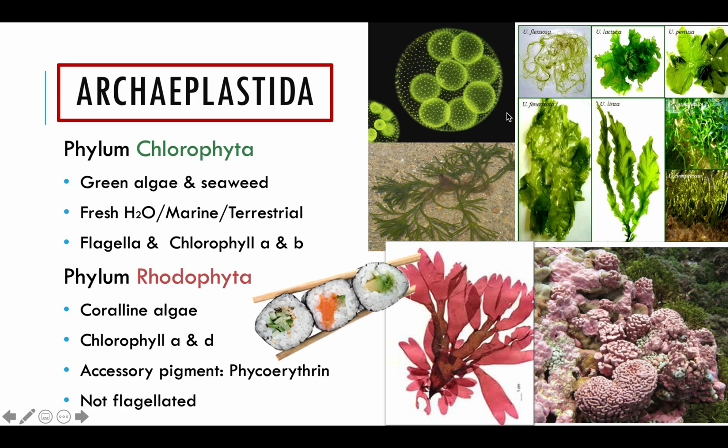So we have organisms like Volvox and algae in this group. If you're looking at a Volvox, this is the entire cell, but inside you have what are called daughter colonies. So these circles, your lab manual is going to ask you to label them. So make sure you label the inner circles as the daughter colonies.